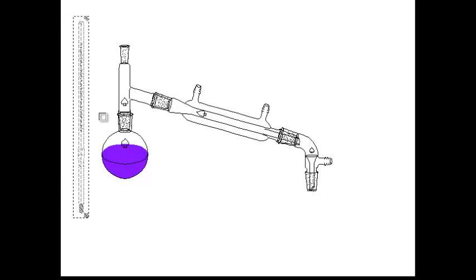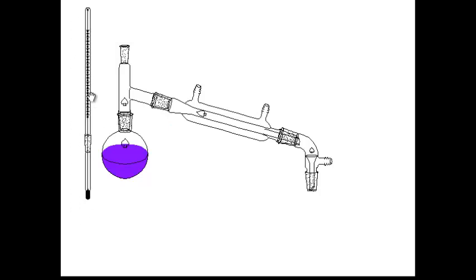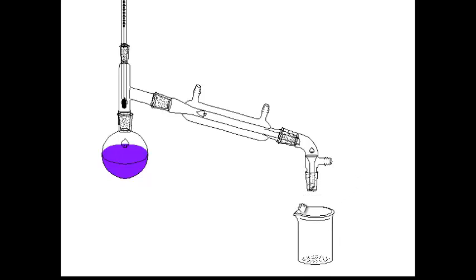Now we add one more adapter to direct the liquid that's produced in the downward direction. And then we can attach a thermometer so that we can track the temperature of the vapors inside the distillation apparatus at any given time. Then we can put a flask of some sort underneath the receiving end of the distillation apparatus and begin heating the flask.